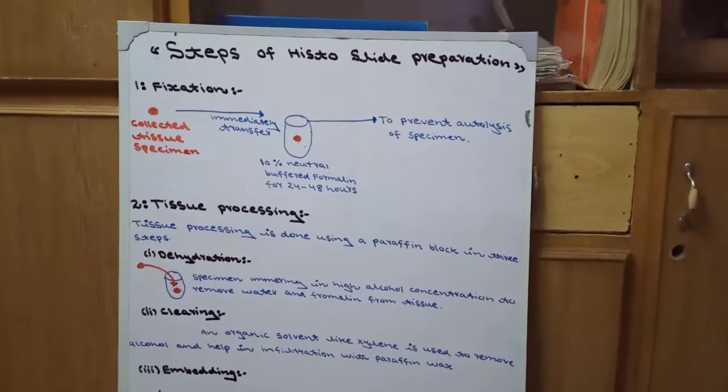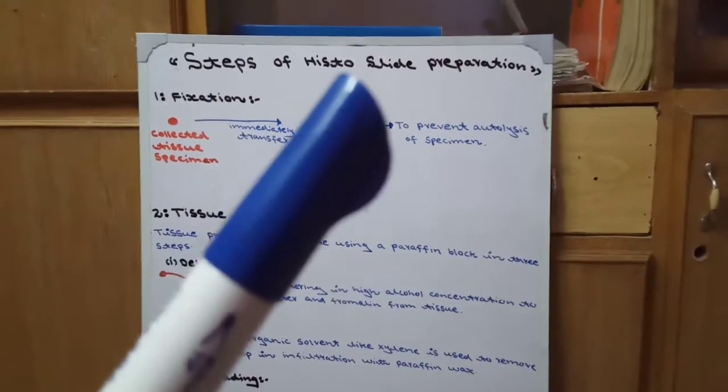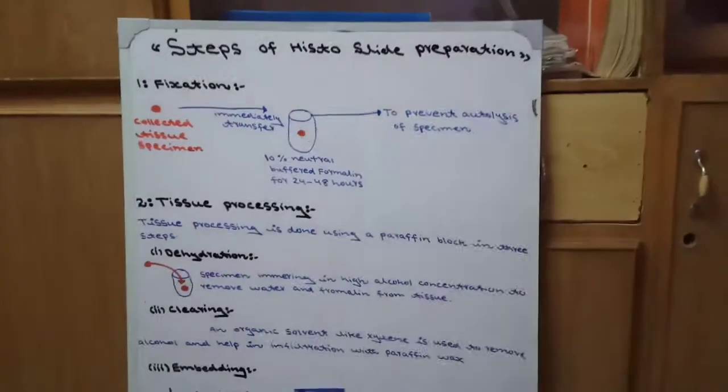Today our topic is related to histology, steps of histoslide preparation.